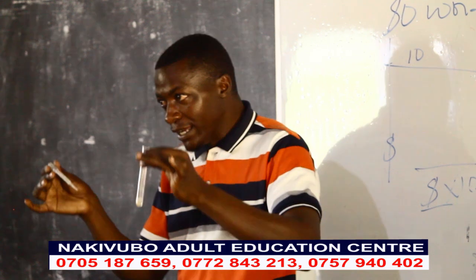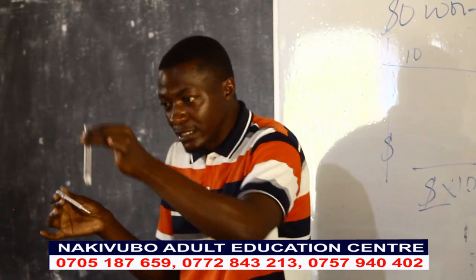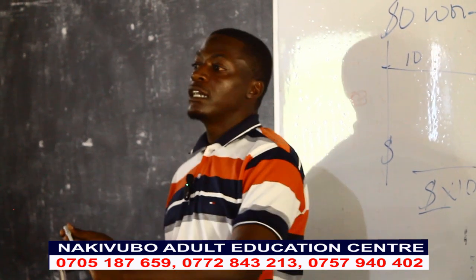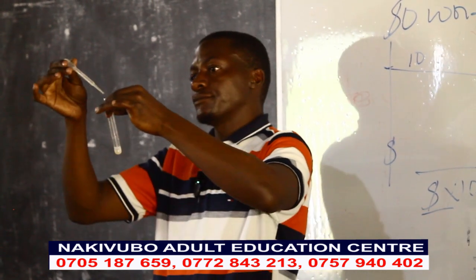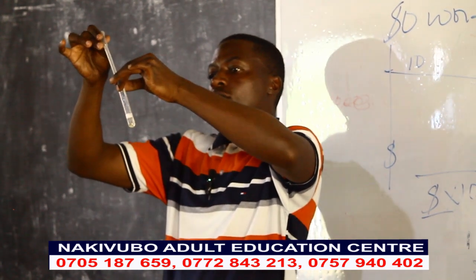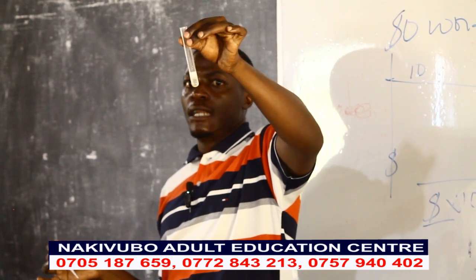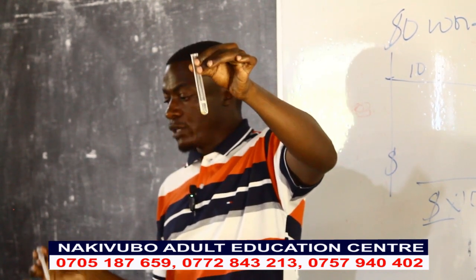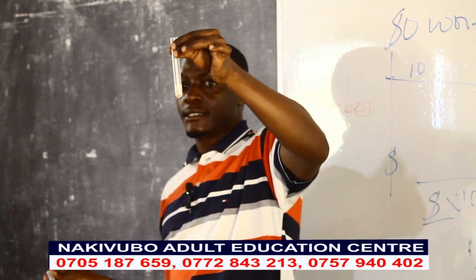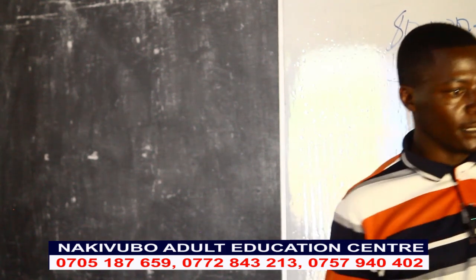If they give you a substance, they tell you to dissolve with an acid, and you see this kind of thing, you confirm in that compound there is a carbonate. You get it? So I have dissolved it. Now, if you still see the effervescence, you keep on adding. You understand? Yeah, you keep on adding. So that is that.